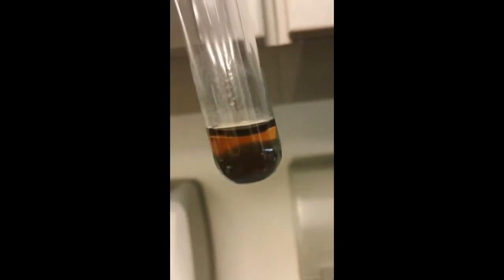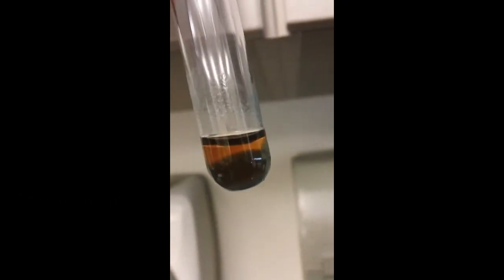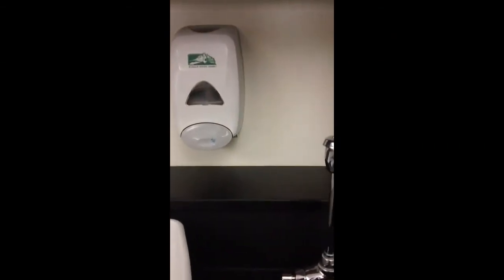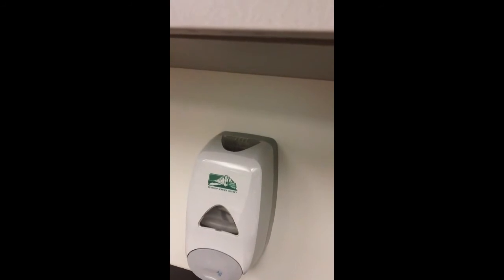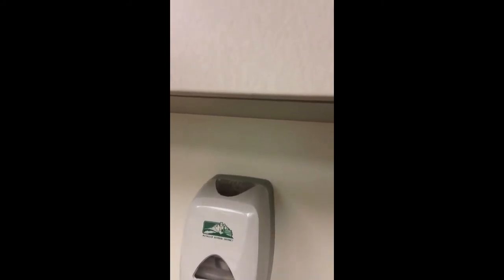Welcome back. I'm on my unknown test C and I have just centrifuged, and notice and record what you see after this step. So I did get a solid, so I need to remove the solid from the liquid. I'm going to remove the liquid from the solid using a pipette. Sorry if you can't see this part. Again, I'm trying to hold everything with just 2 hands. But right now I am removing the liquid from the solid over here.